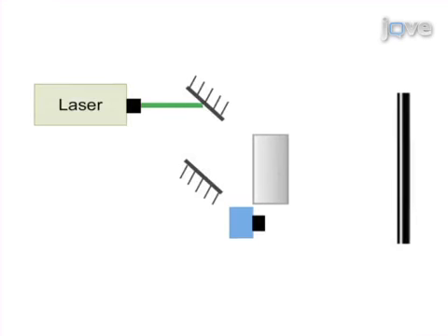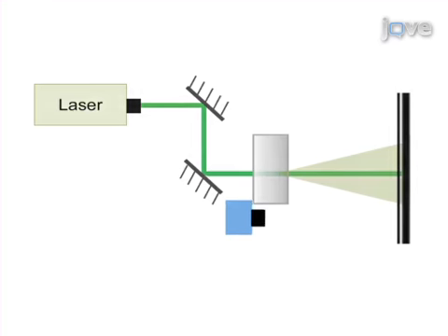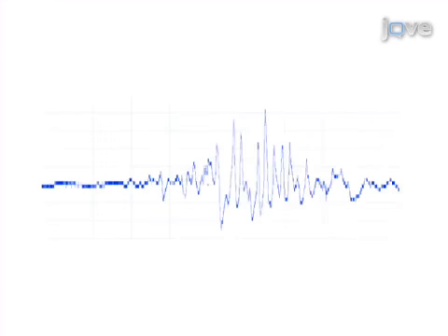Next, the optical setup is prepared. Then, the diffraction pattern introduced by the live organisms is recorded. Finally, the recorded data is analyzed to determine swimming frequencies.